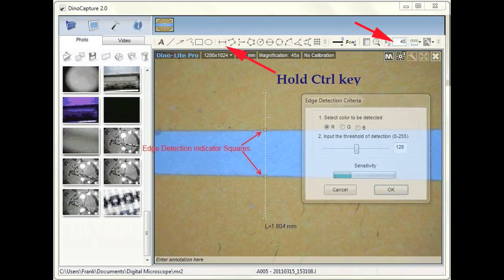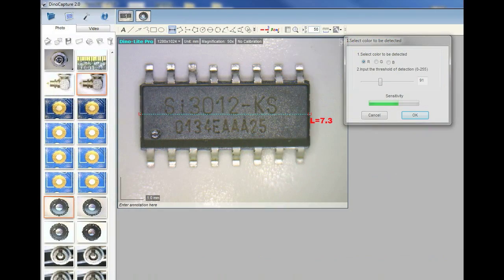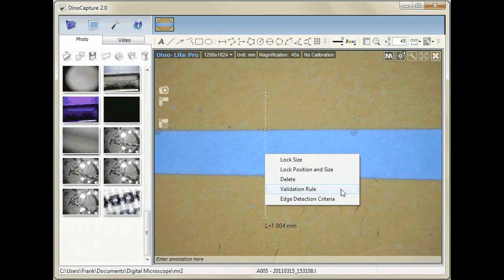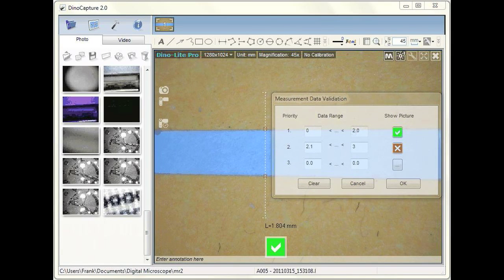Hi everybody, this is the third part in a series of videos where we're going to be demonstrating some of the useful features of Dino Capture 2.0. In this video I'm going to show you the new edge detection feature.